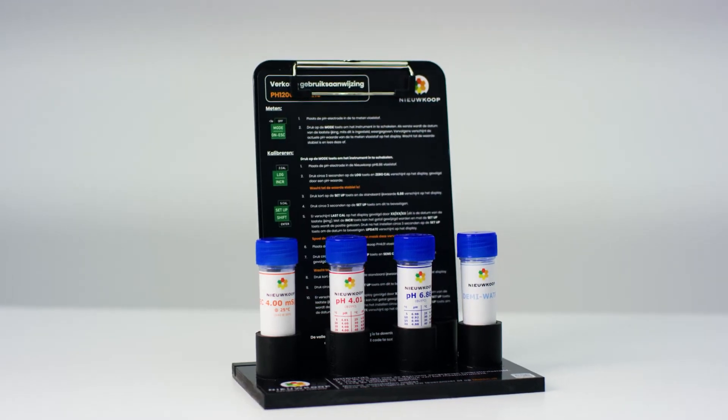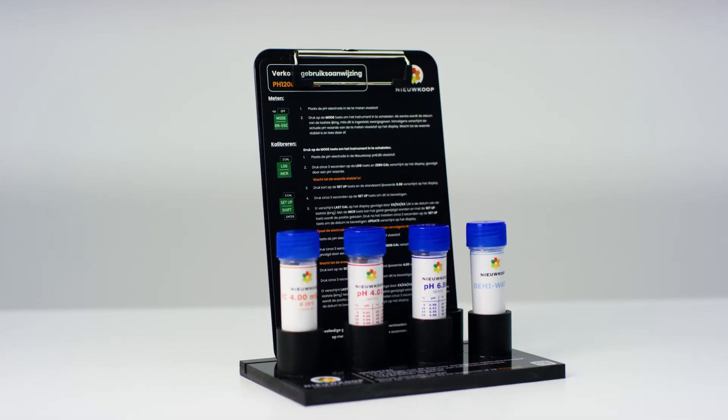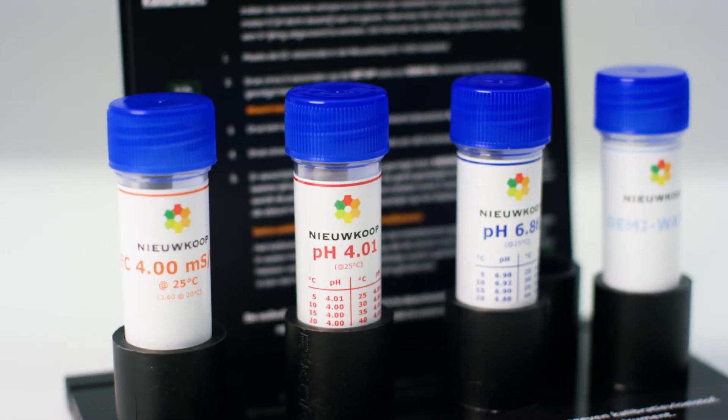To make the calibration more simple we use the Nucope calibration station. This ensures that you can work clearly and guarantees that you can calibrate in clean liquid.